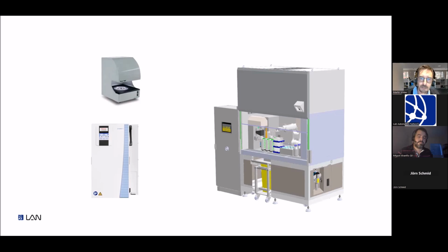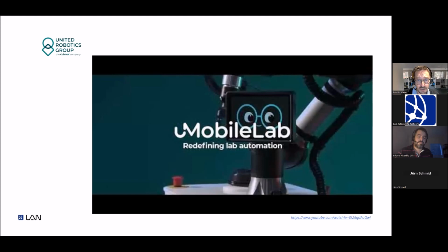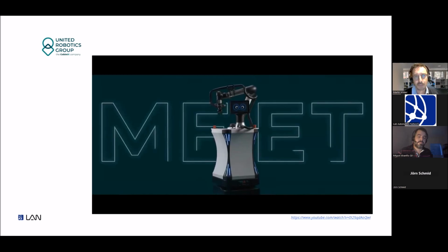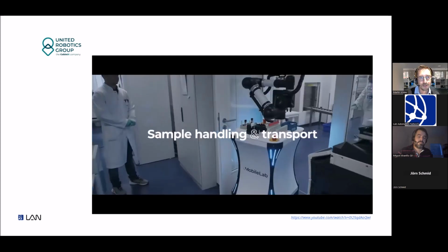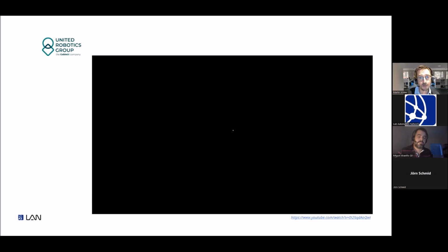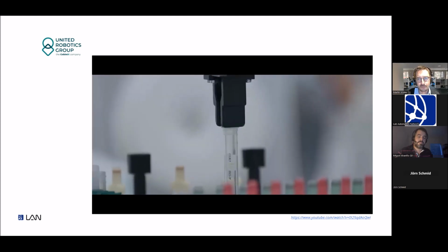in the beginning, but you can also use new technologies like mobile cobots, which are now robust enough to perform such tasks. Let me see, I hope we can show you this video. Yes, we can. So this is one of our partners in the network, United Robotics Group from Germany. And what they offer is a solution that's not only capable of transporting plates, but also to open lids, open doors from incubators, doing much more, even as you see here, opening and closing caps, loading centrifuges.